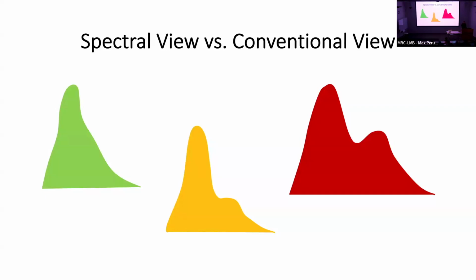The other thing that I really want to emphasize about spectral, that's an advantage over the conventional older systems, and there are a few: when you're binding your fluorophore to a protein, maybe you're looking at a certain antigen and you're using a tandem dye. I think Nick will potentially discuss tandem dyes a little, so I don't want to talk too much about that. But if you're using a tandem dye with a donor and an acceptor, sometimes the tandem dyes fall apart.